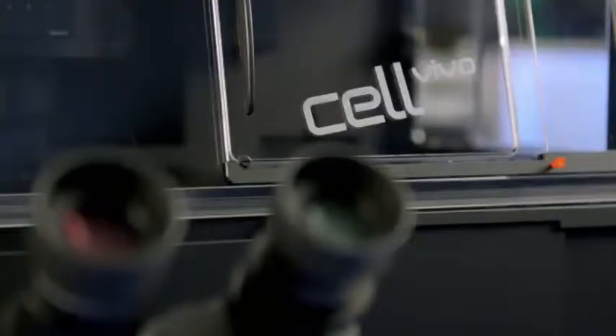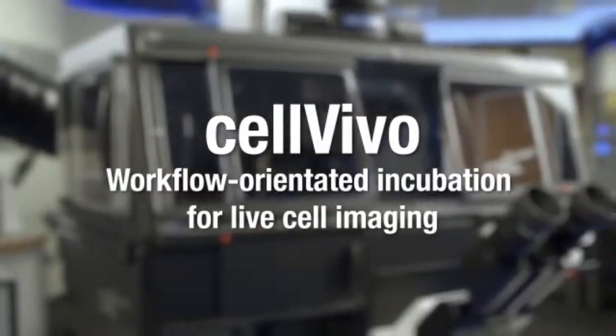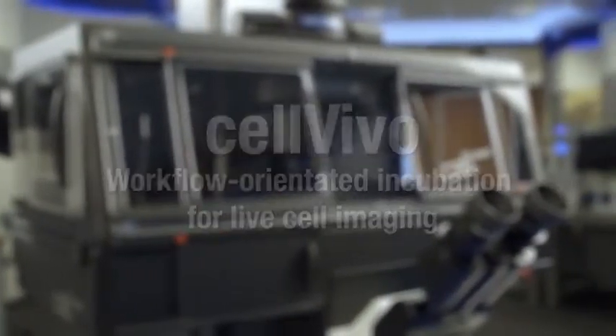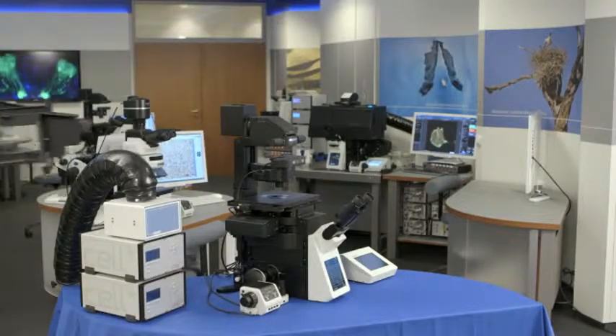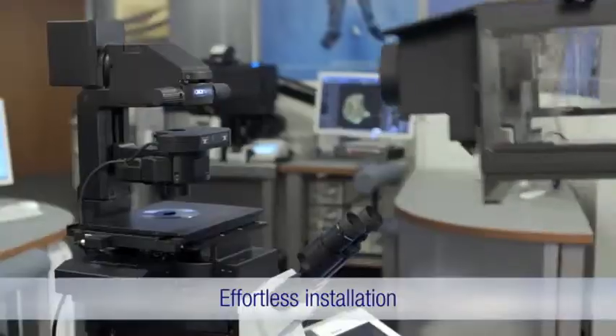Cell Vivo: workflow-oriented incubation for live cell imaging. Replicating specific in vivo conditions during live cell imaging ensures your cells behave true to life for truly insightful data.